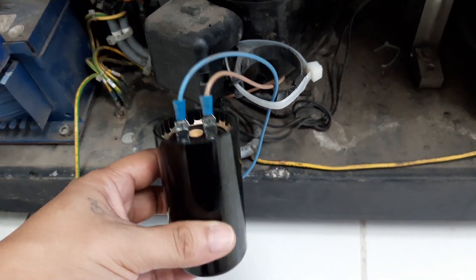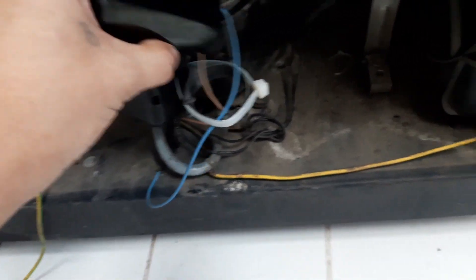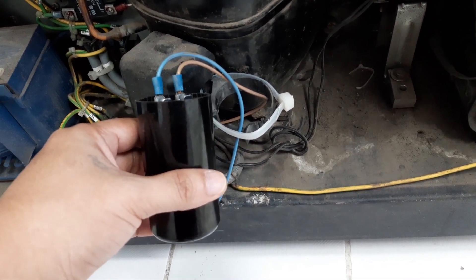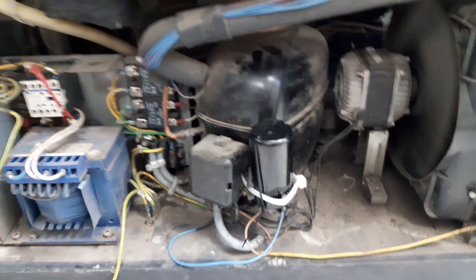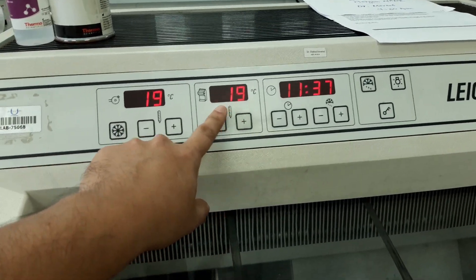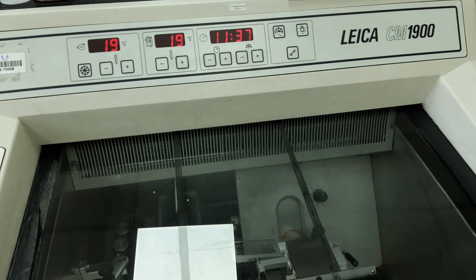So I connect the capacitor now. The temperature is at 19 degrees Celsius. We are expecting that after a few minutes the temperature should go down.